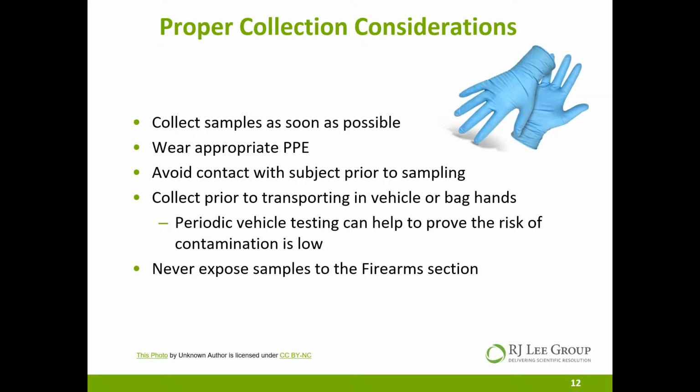Just a few considerations to think about whenever you are getting ready to collect samples. You want to collect samples as soon as possible after apprehending a subject, and preferably before transporting him or her to a police station. Always wear gloves when collecting from a subject to prevent contamination.